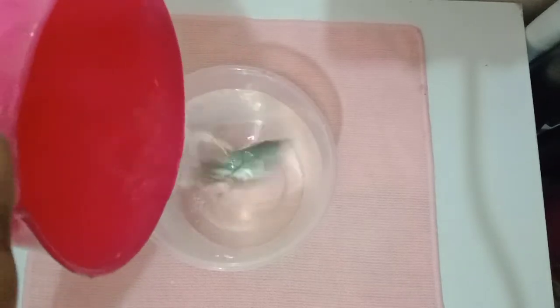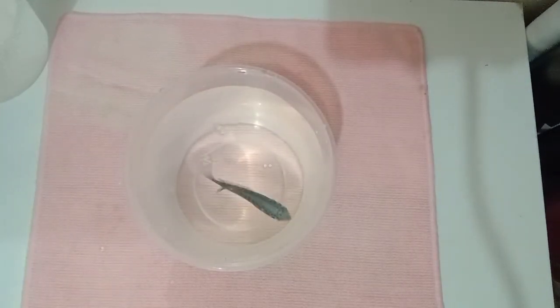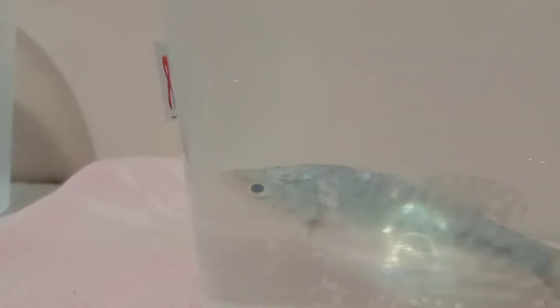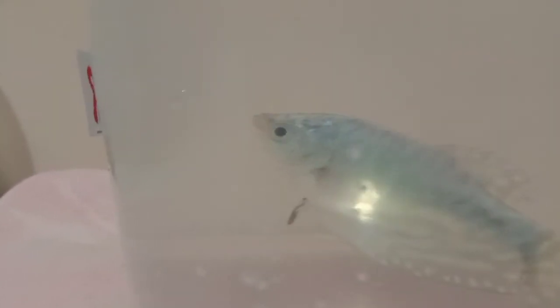First, put the fish in the beaker that contains 200 ml of tap water. Next, we observe and record the number of breaths every minute by counting the number of times the fish opens and closes its mouth for 5 minutes.